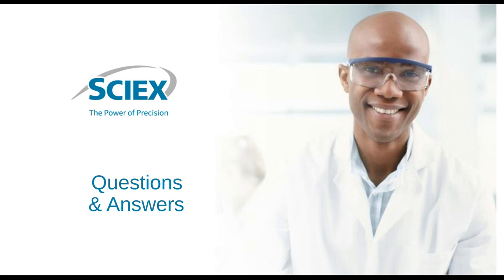Would you agree, Steve? I think that's right. I think you're right with the column blocking. With CE we use an open tube which we fill with gel, and then we re-clean the tube between every injection, right? So it's not filled with particles like you have with the HPLC column, so there's less chance to block. So capillaries tend to be pretty robust, and you can run it for loads of injections.